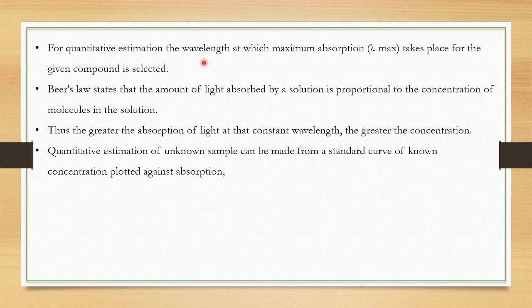For the quantitative estimation, the wavelength at which maximum absorption takes place for the given compound is selected.